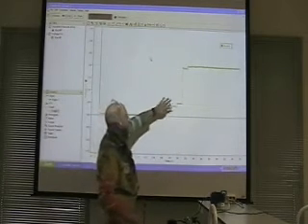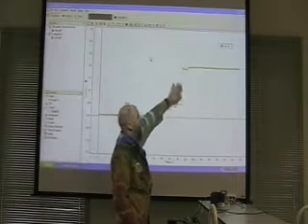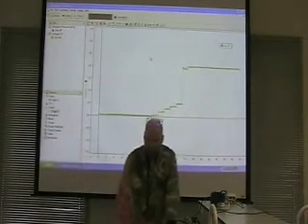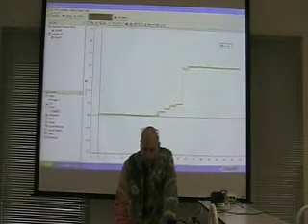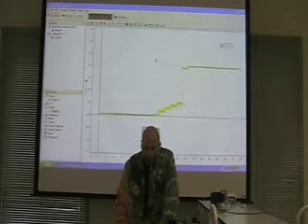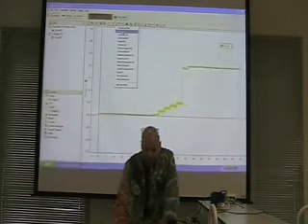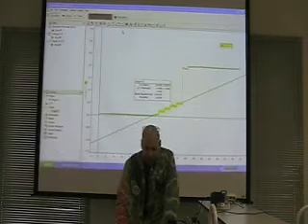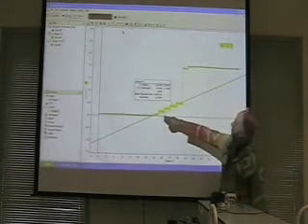Also, once you get above two on there it won't really read very well anymore, so my guess is right around here is two and this is basically the machine saying I don't know how to deal with that. But you can, the machine probably can deal with this box here. And that box there you can then go ahead and start to do try fits on it and see if they work, like that's a linear fit for instance.